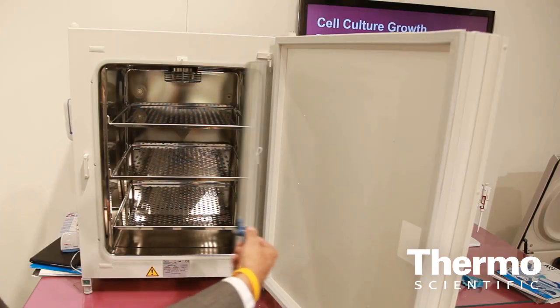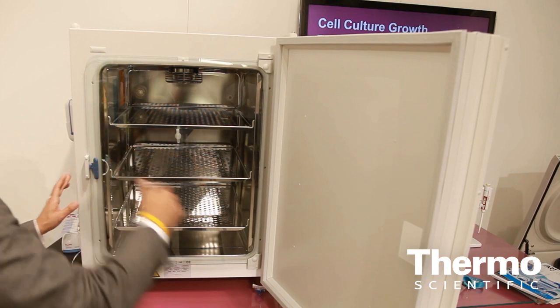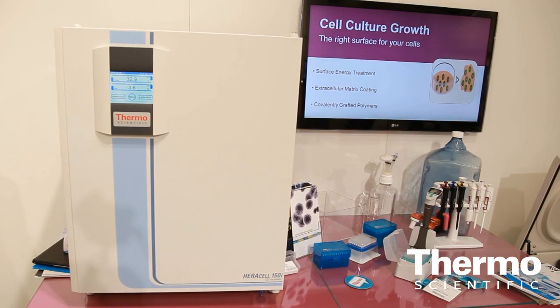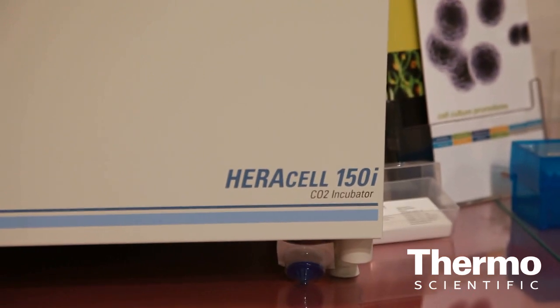So as a CO2 incubator manufacturer, we love to have those discussions with our customers, asking them what is it that's giving them problems, issues with their work. And one of the things that we found is contamination. In fact, contamination is the leading concern that comes out.